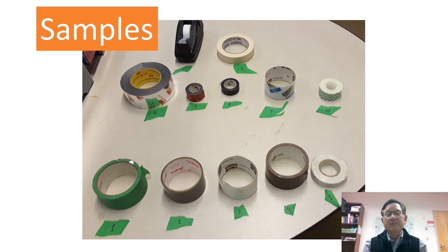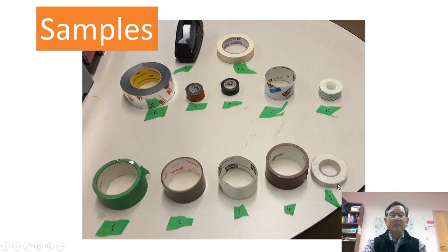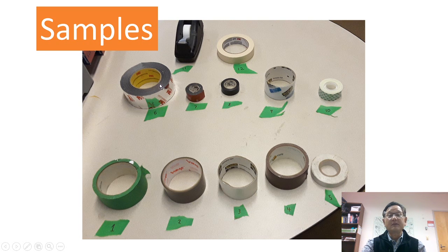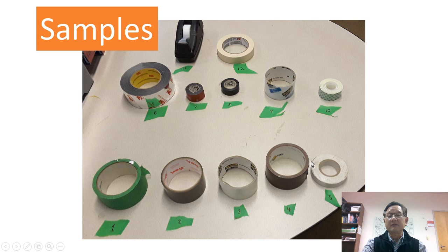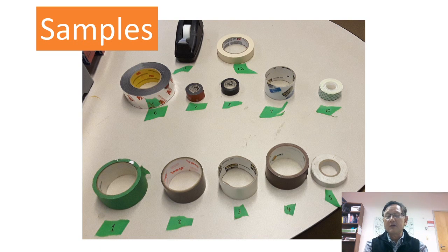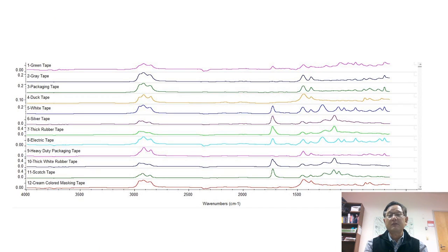We took some tapes from our home. One is a masking tape, different kinds of packing tape, electrical tape, silver tape, scotch tape, and duct tape. We can bring the sticky side and put it into the instrument called the IR instrument, and we're taking those pictures that look like that.